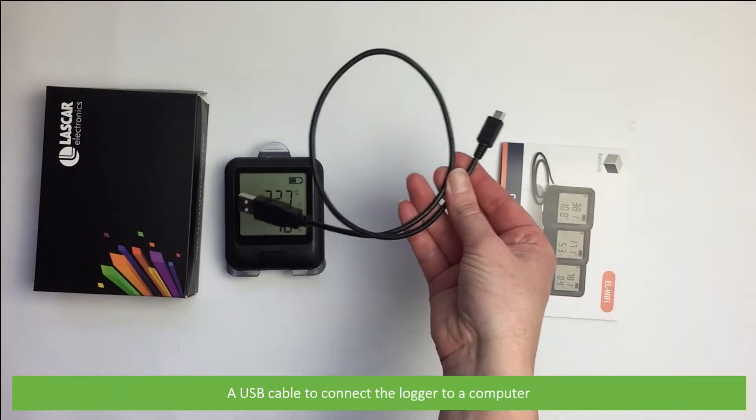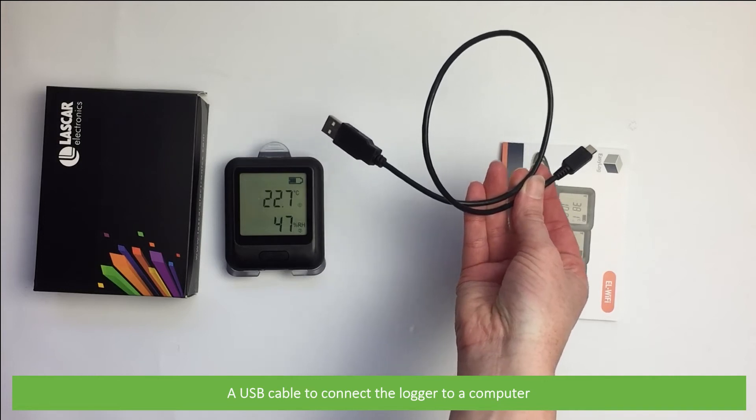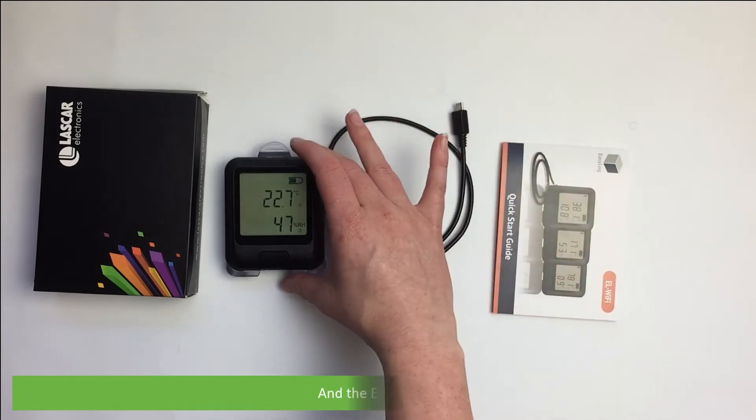A USB cable to connect the logger to a computer, and the EL Wi-Fi TH itself.